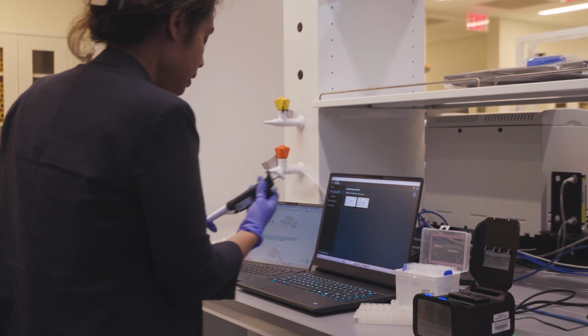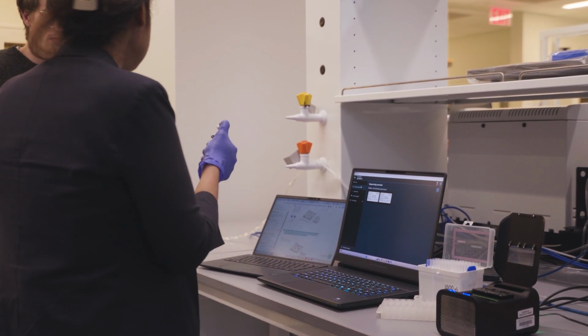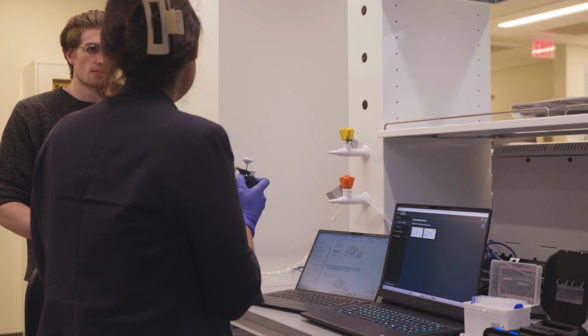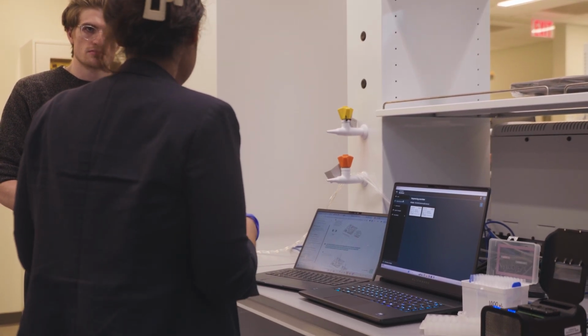So the way I like to do it, and it all depends on how you wanna do it, I don't push it. I just dial it down slowly. In that way we have more control, and no air bubble goes inside.